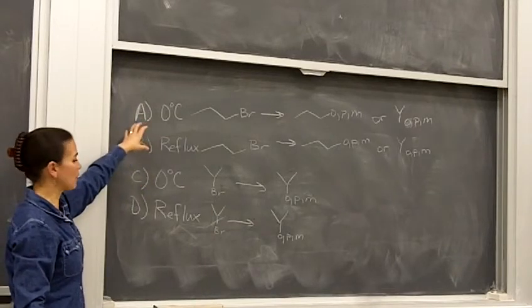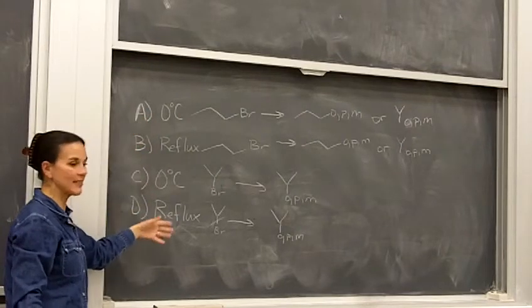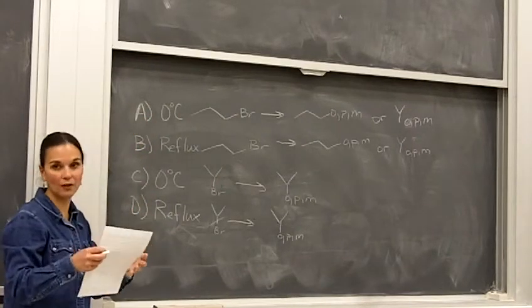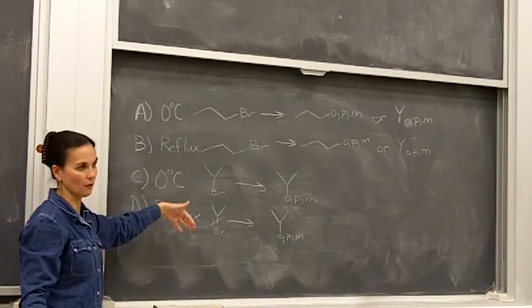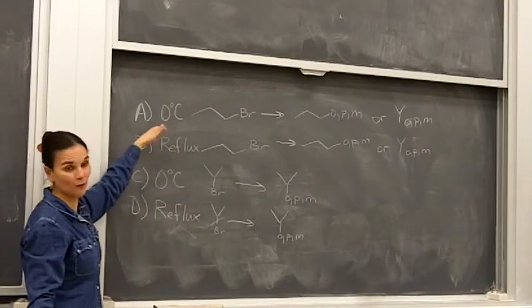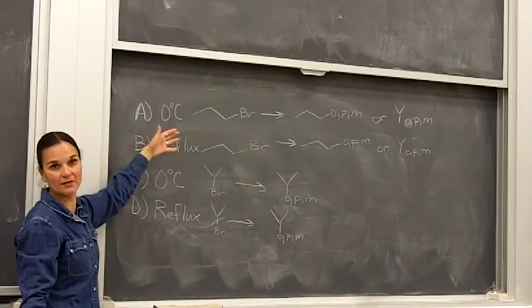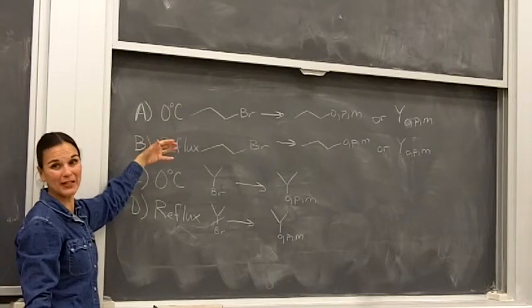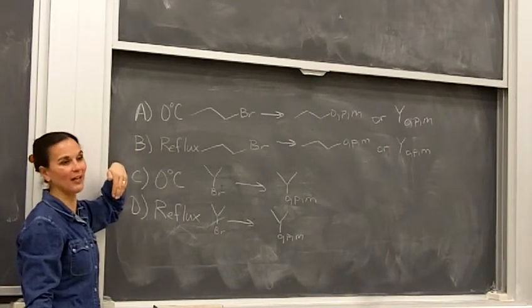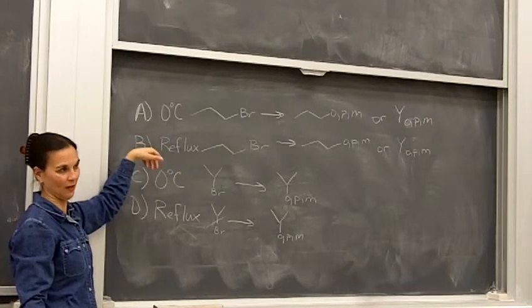So when we go to the data comparison part, we're going to have a group of A, B, C, and D data that all of you are looking at, and that is going to come from the different members of your group. So you're doing one reaction, but you're a member of 4 people's data, including yourself. Be really careful when you're doing it, because not only does your data count on it, but 3 other people are counting on what you're doing with your reaction.